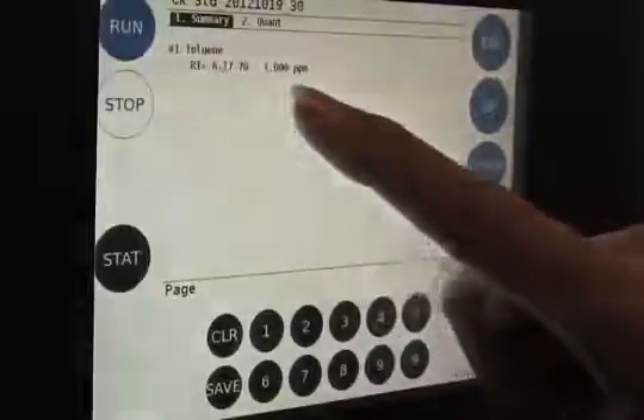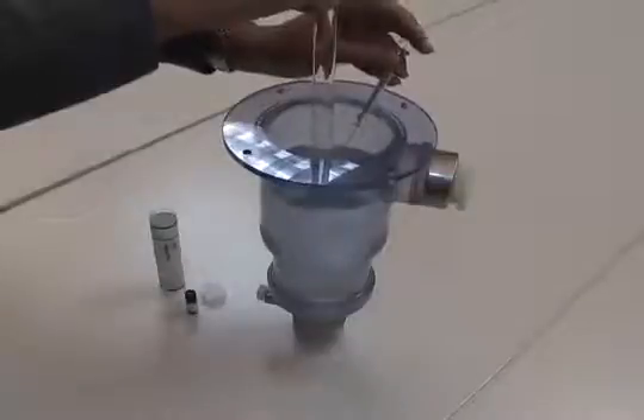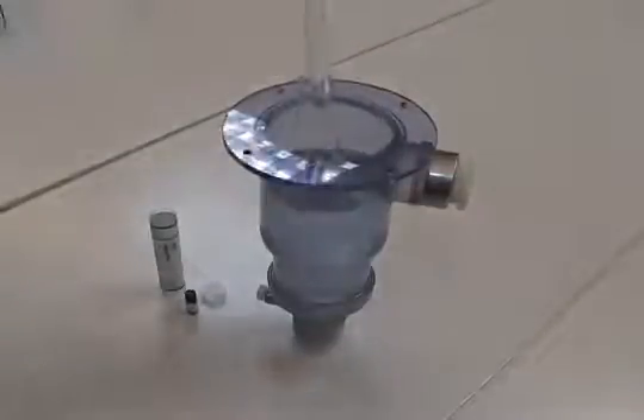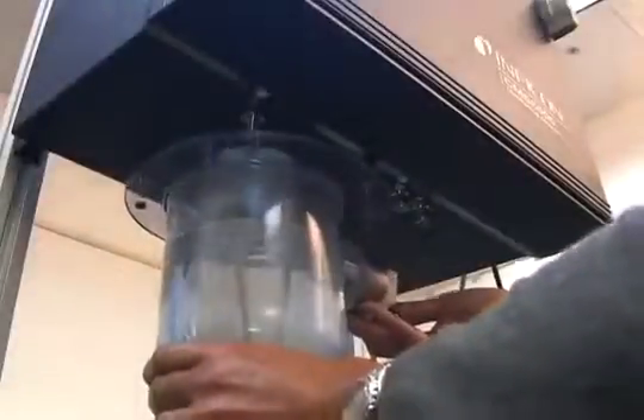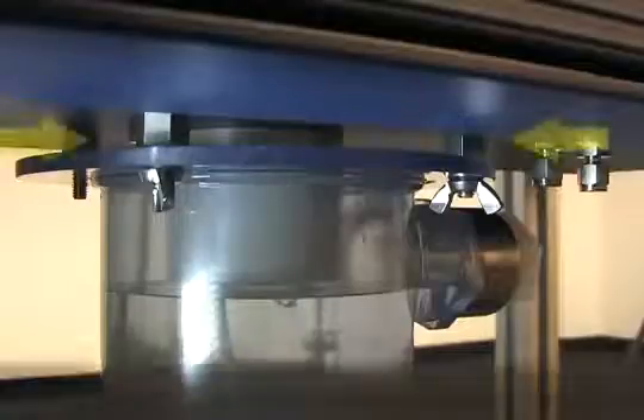To view page 2 of the text report, select Down. To prepare the calibration standard, the 1-liter sample vessel is spiked with 2.5 microliters of the 19-compound calibration standard. Based on the initial concentration of the calibration standard, the resulting solution will contain 5 ppb of each compound. Ensure that the vessel is attached to all four standoffs on the bottom of the instrument. Wingnuts are used to secure the vessel in place. There is a small gap between the bottom of the instrument and the top of the sampling vessel, designed as an overflow mechanism to prevent water from being drawn up into the instrument.